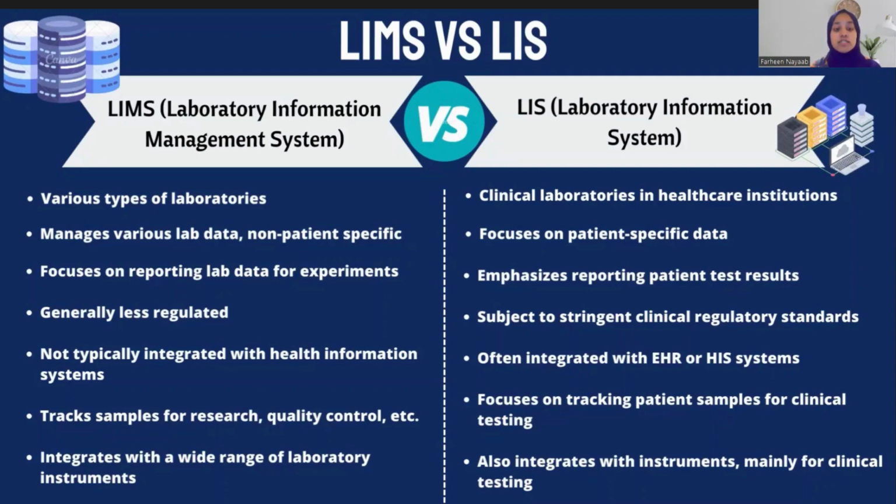Now, LIMS tracks samples for research, quality control, etc., while LIS focuses on tracking patient samples specifically for clinical testing. And LIMS integrates with a wide range of laboratory instruments. LIS also integrates with instruments, but they are specifically for clinical testing.